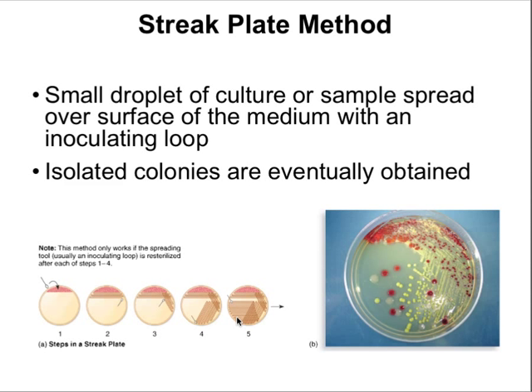The key here is you've got to sterilize the loop after each pass, otherwise you could get weeds in the garden, or contamination. This streak plate method is the method that's used for most applications in microbiology. However, there are a couple more.